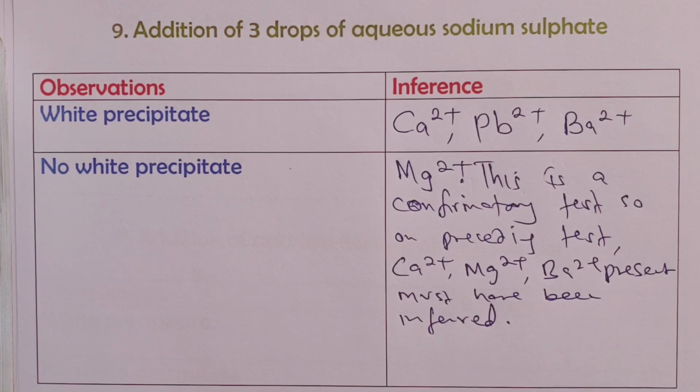This we said with ammonium hydroxide, and we are also saying it with sodium sulfate.